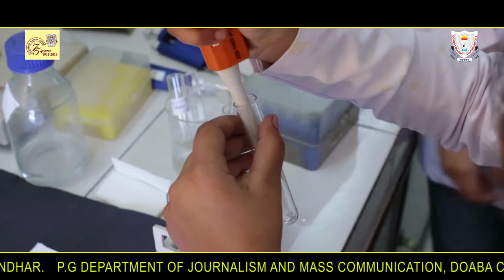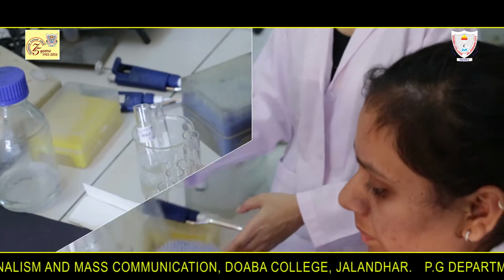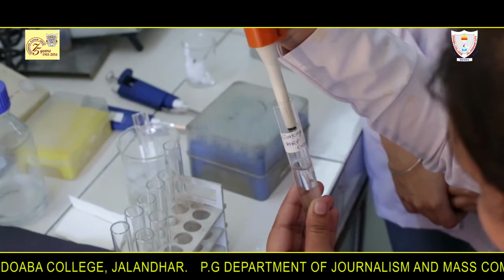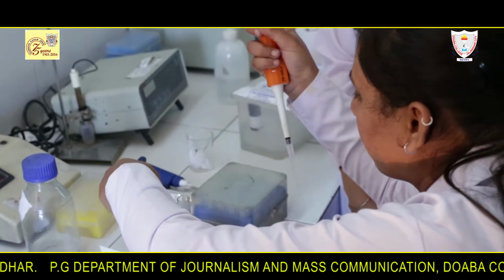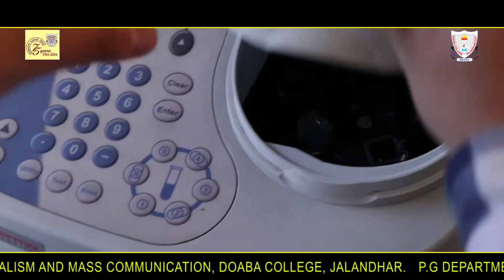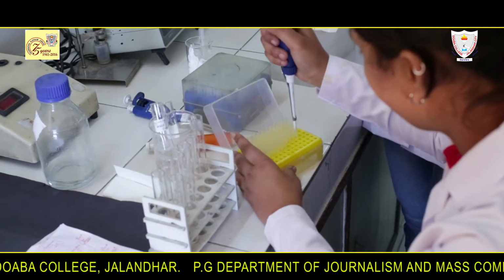Add the reagents in tubes as mentioned earlier, taking into consideration the increased enzyme concentration. Adjust the reading to 0 absorbance with tube 1 blank and start the reaction by adding 1600 microliter of HRP solution to tube 2 and read the absorbance of the mixture at 470 nanometers at every 30 seconds interval for 3 minutes. Test B. Half the amount of enzyme.